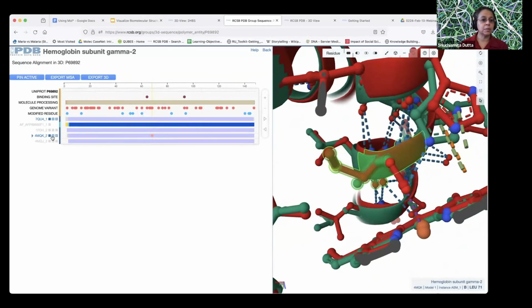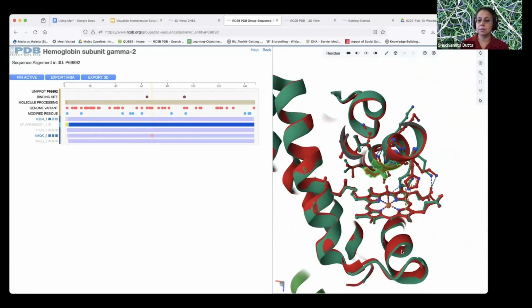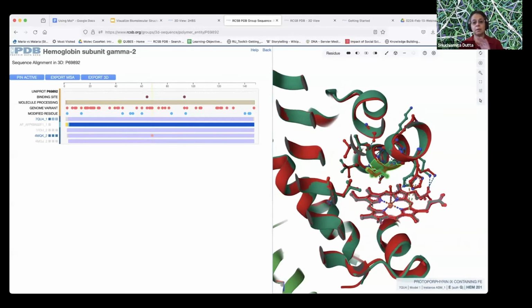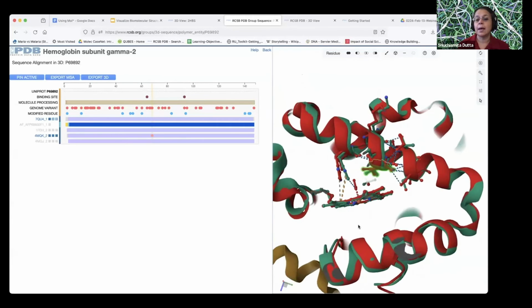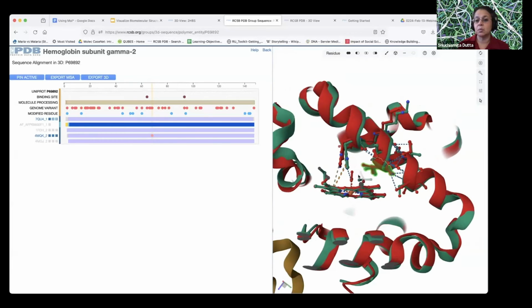And how do I know the significance of this location? I can display the other polymer chains, and this is near heme. And long story short, this is actually a documented mutation, the Toms River mutation, which is a valine 67 to methionine mutation that has problems with binding oxygen simply because the side chain is so much larger.